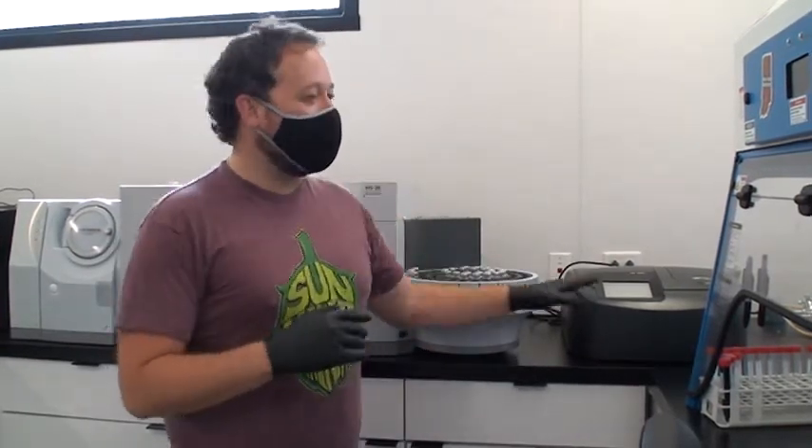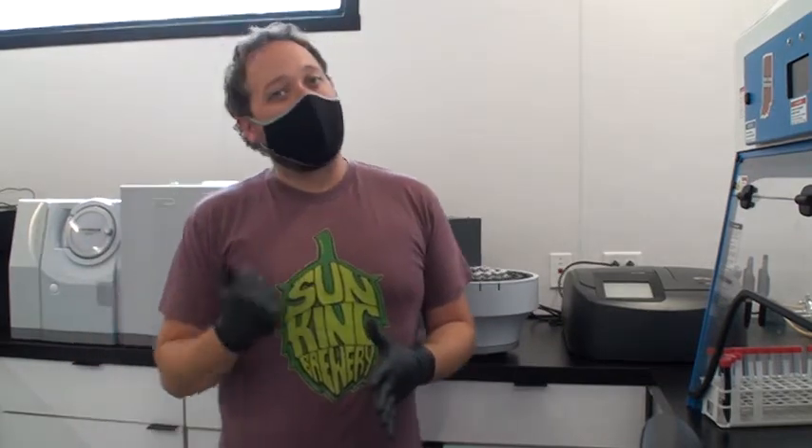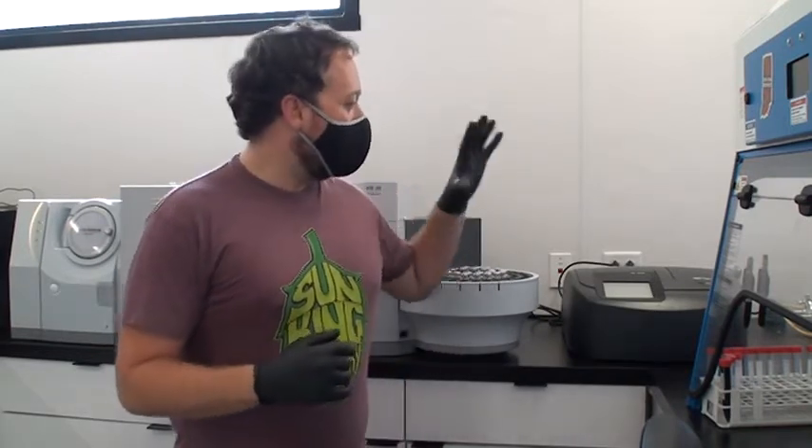For us, we use this instrument for testing bitterness, color, IBUs, diacetyl, protein, carbohydrates, and things like copper content. I've also been experimenting with other things. It's very universal for a lot of really neat tests, though it's a little tricky to set up some of the experimentation.